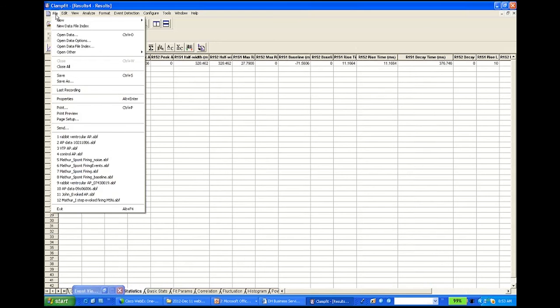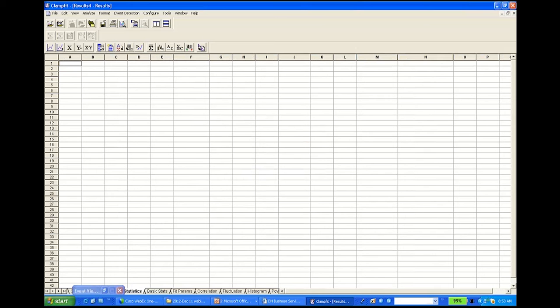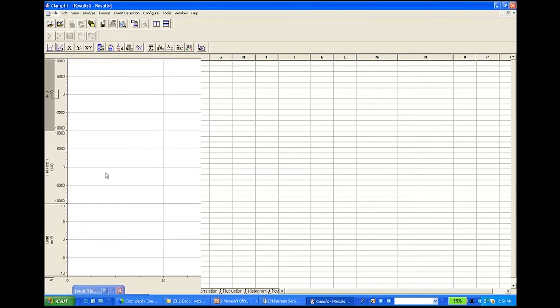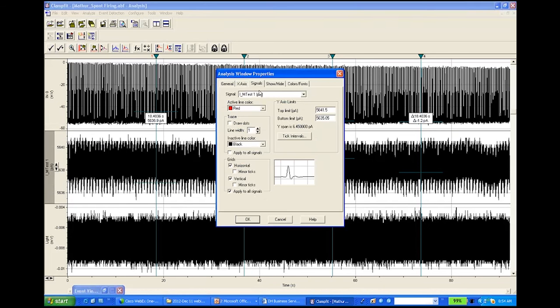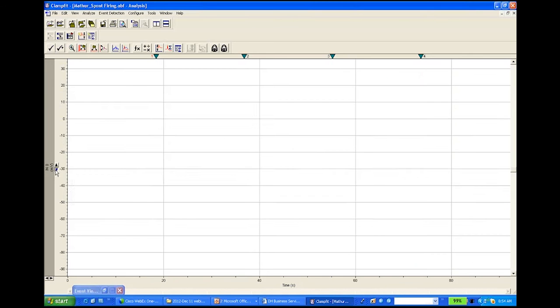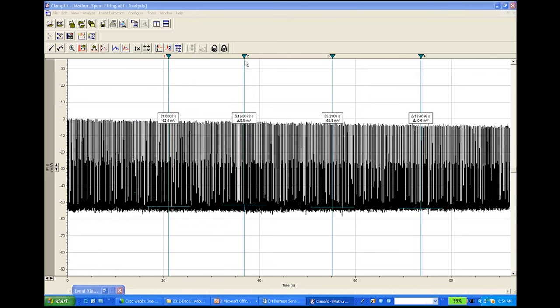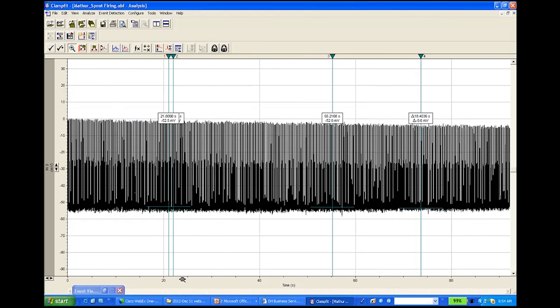The last experiment I want to show you is how we can accept, reject, and suppress events. Okay, so I want to bring out this spontaneous recording, right? So again, we can go through this one. How we can hide it? We can just go to here, right? And like I said, you can set up here, go to the 21 second, and this one go to 22 second. Okay, now I just enlarge this one.